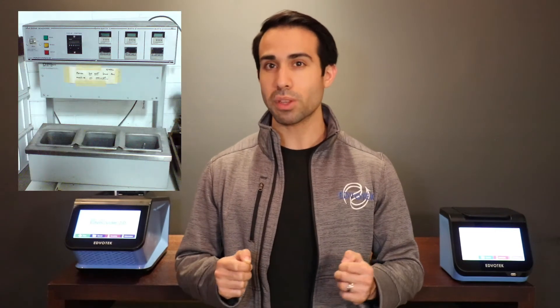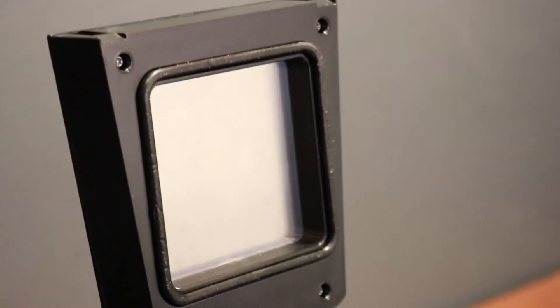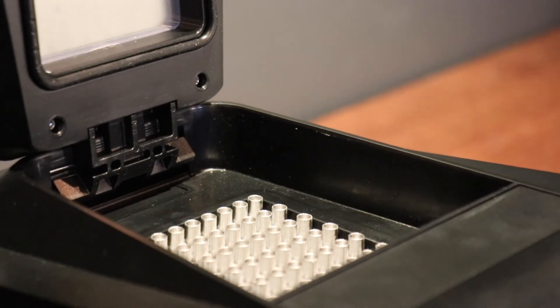These amplified samples can then be visualized using gel electrophoresis, sent off for further sequencing, or cloned into a plasmid for experimentation. While some of the first thermal cyclers utilized water baths, these modern ones utilize heated thermistors which can be programmed to follow a specific pattern of heating and cooling. These heating elements are connected to both the lid and the sample blocks to ensure that the samples are heated evenly and throughout.